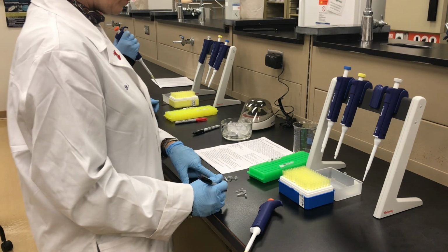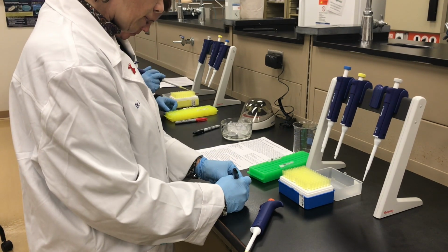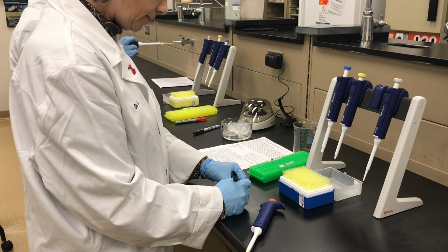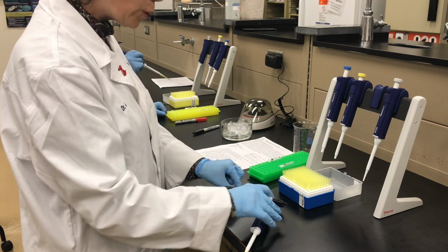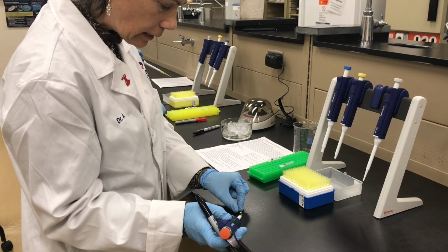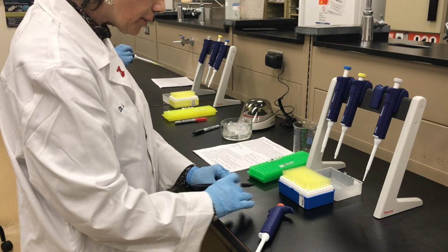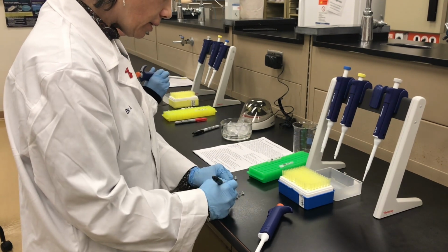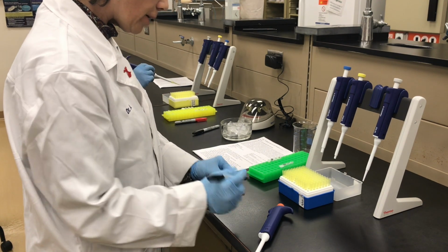I used a star and just a dash. Star and a dash. So I'm going to use a triangle. I forgot I had to set both. Oh dear, look at that. Little stinkers. The static electricity, the gloves, can cause that to happen.